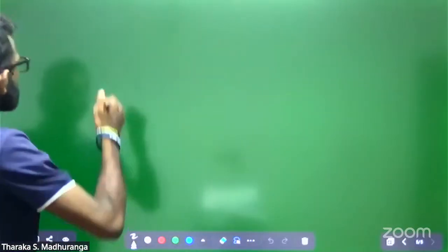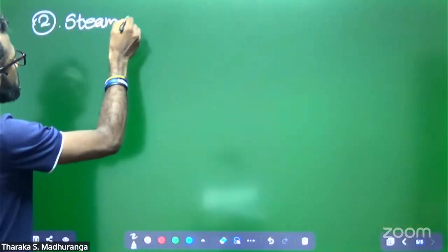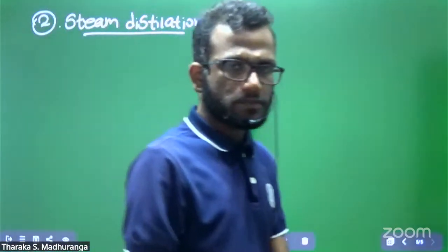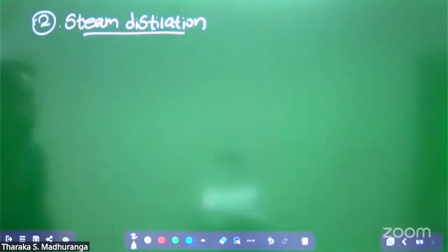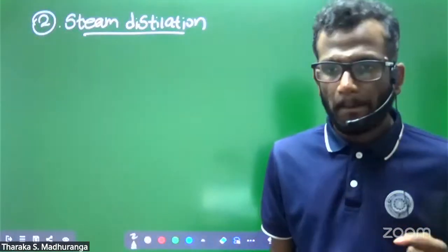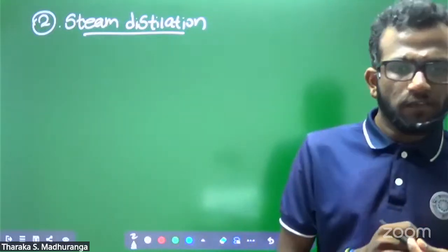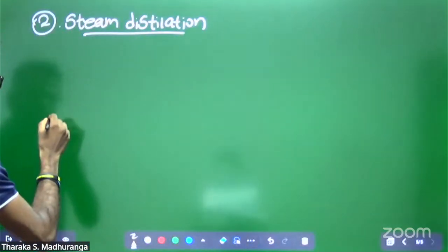Second distillation method, the steam distillation. The steam distillation is the same as simple distillation, but only one step is different. First, understand the process.